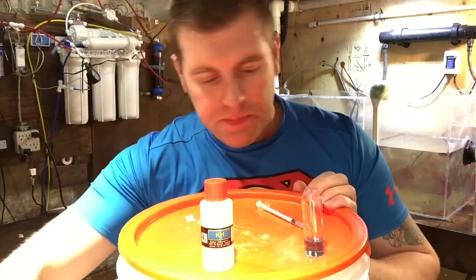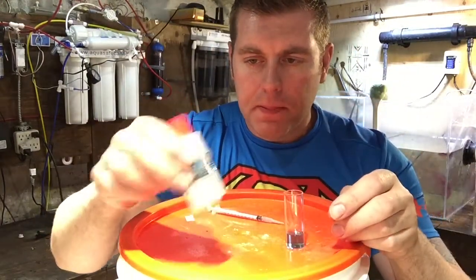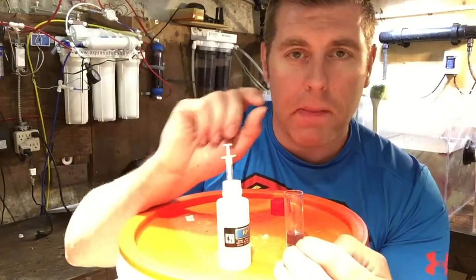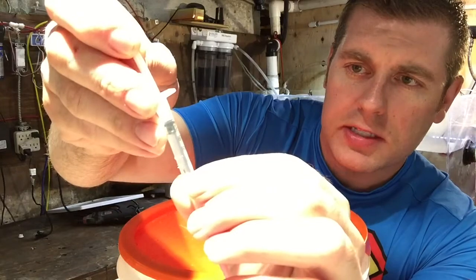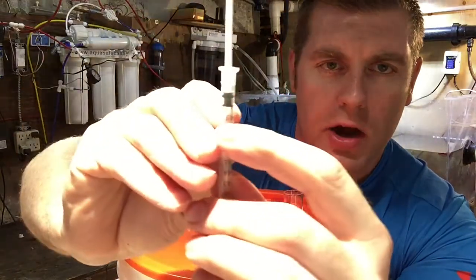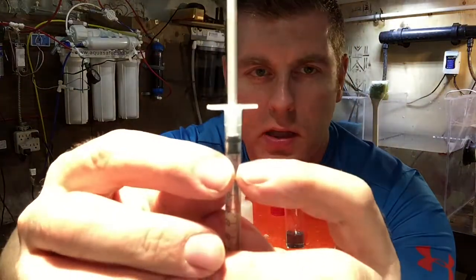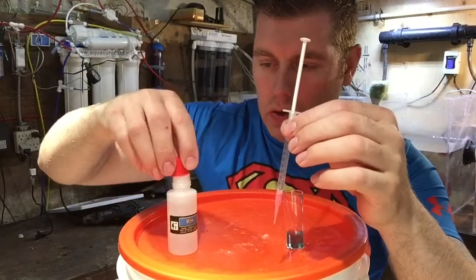Now take your KH reagent solution and the one milliliter syringe. Shake the reagent up a little bit. Put the tip underneath the solution and raise the piston to the one milliliter mark. The tip actually takes up air, so there will be an air gap between the solution and the piston — that's typical because of the pink tip. Make sure your piston is right at the one mil mark, then cap the reagent bottle so you don't spill it.